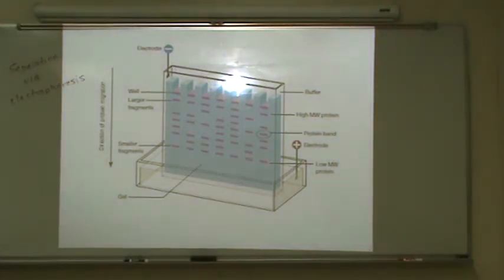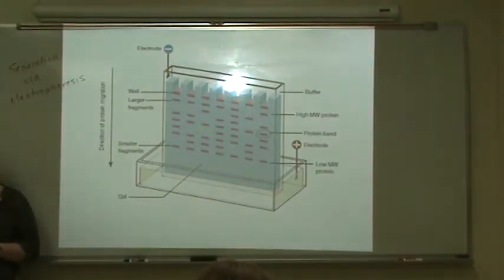Separation by electrophoresis. How many of you have run a DNA gel? Ooh, really? Okay. You're going to really enjoy next week's lab then. Sometimes I'm like, people have already done this.